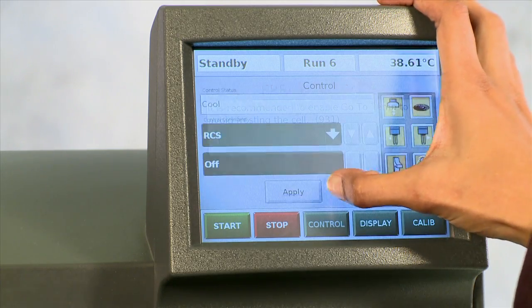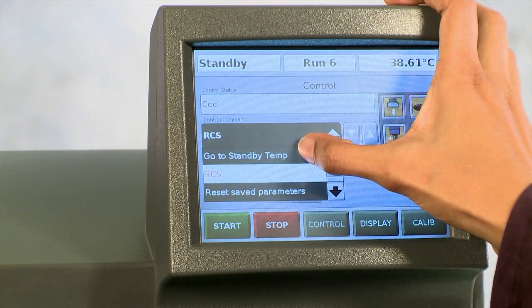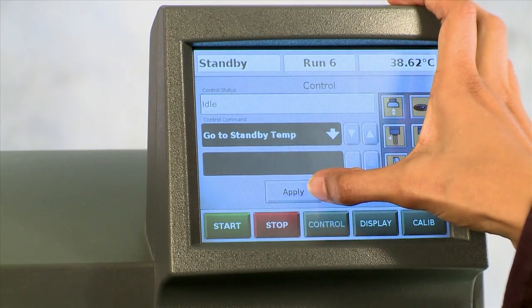You may do this from the touch screen as well, by pulling down on the menu, selecting go to temperature, and selecting apply.